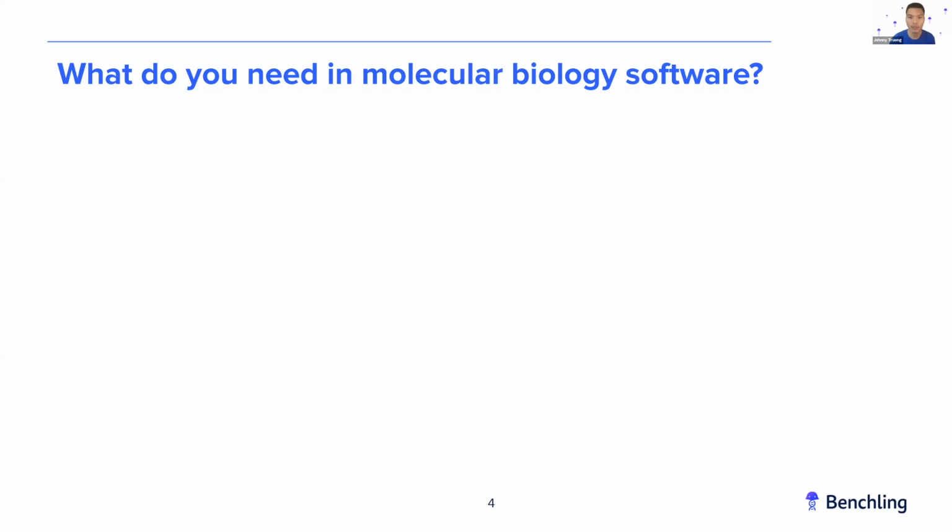Now, I think something I really want to share with you all is my own story where when I was an undergraduate, like many of you are now, I never really questioned the tools that my mentors told me to use when analyzing data and designing constructs. And in many ways, I wish I did. While I was in graduate school, I really learned that identifying my personal research needs first, I could often better find more effective solutions that really remove busy work and increase my productivity.